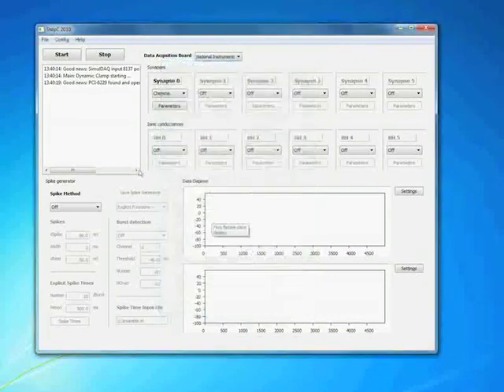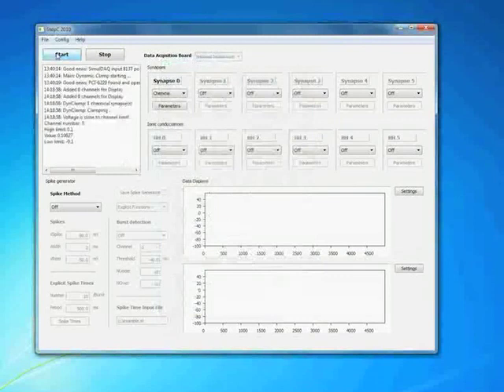And all that is left to do is then to start the dynamic clamp. So I hit start. And you see a lot of messages appearing here. No channels being displayed. Dynamic clamp is configured with one chemical synapse. And it is started and is running.